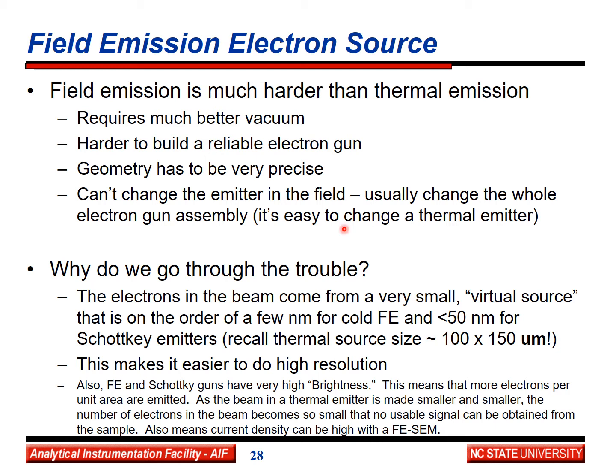It takes about 30 minutes to change a thermal emitter. If it blows out, you change it yourself. You don't call a service guy. So why do we go through all the trouble?